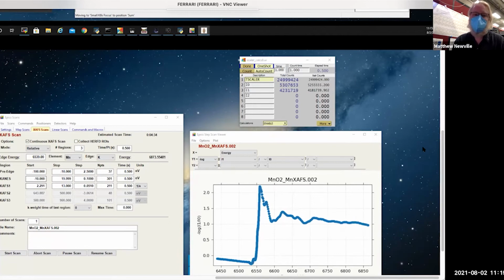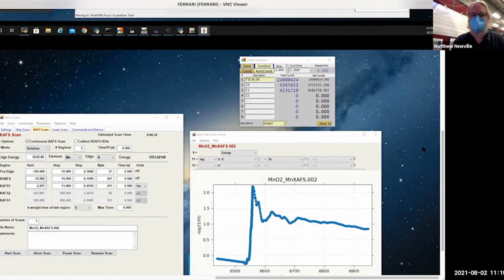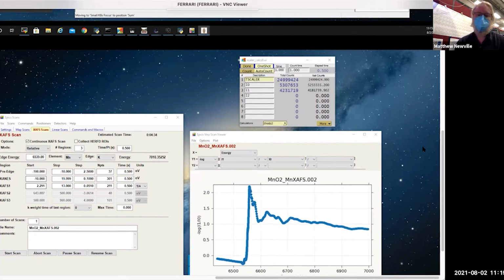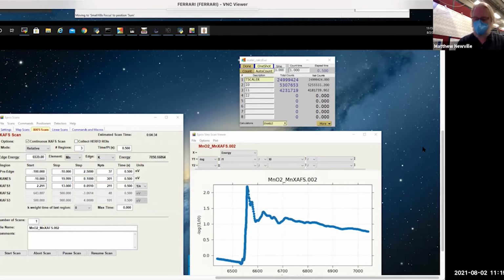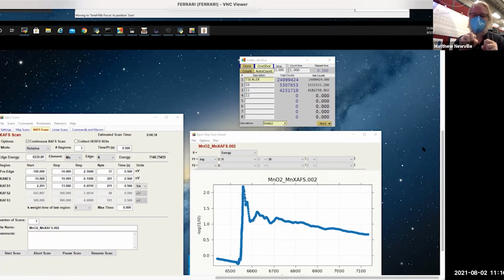That's really hard to do because the powder size of a manganese oxide powder, or any metal oxide powder, is at the 5 to 50 micron level. You have to grind a sample pretty well to get it below 5 microns, unless it's already a nanomaterial. And many metal oxides don't make good nanomaterials. They stay at 5 microns or so, which is about one absorption length. So you're left with samples that are little rocks of about one absorption length, and you want to make that into a sample that's very uniform.